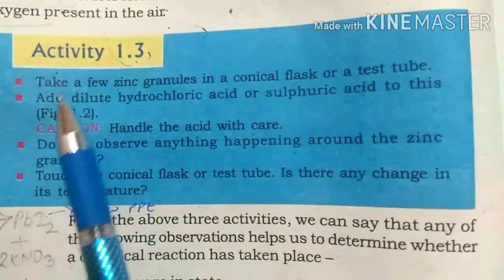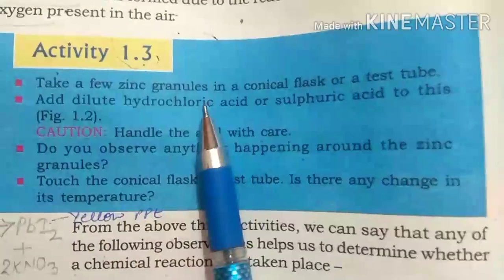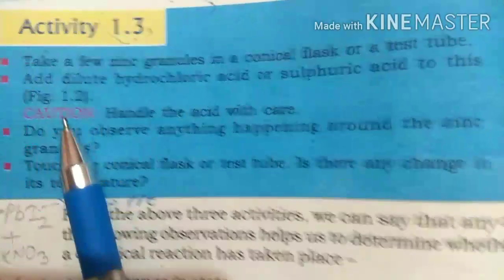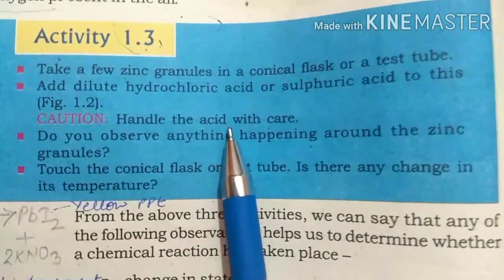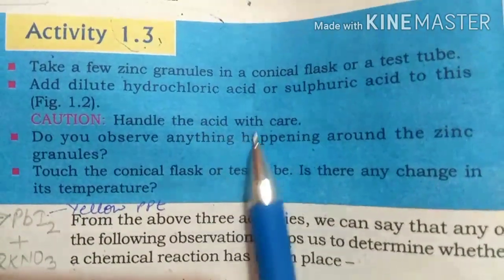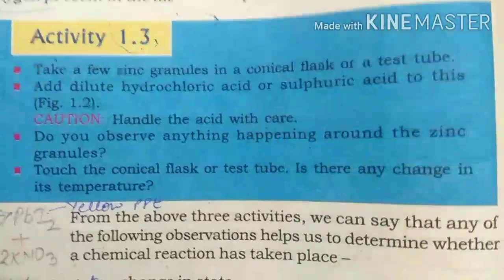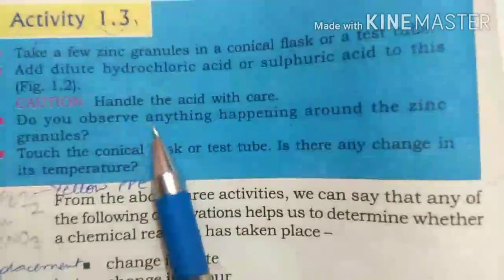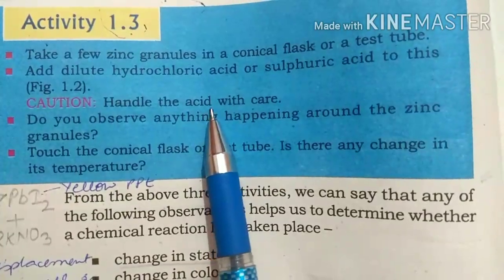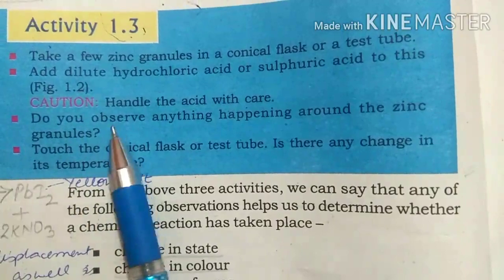Okay, dilute means its concentration is very less. It is mixed with water. Now, caution is that we have to handle the acid with care because acids are corrosive in nature. If by mistake they fall on your skin, they can burn your skin or they can even burn the bone also. So now next is observations.